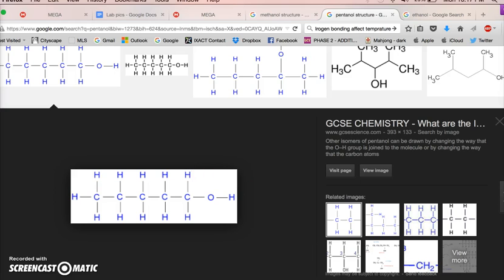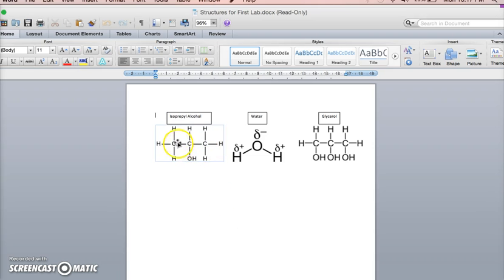And finally, when we look back at our isopropyl alcohol, it only has 3 carbons and fewer additional elements attached to it. Therefore, it had a smaller molar mass than the pentanol, but still greater than the methanol, making it the brown line, which was basically in the middle.